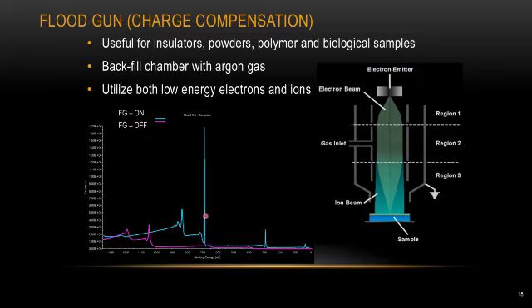When the argon is turned on, we can define each peak very nicely. For instance, the small peak right here, that's a carbon 1s peak. And the huge peak right here, that's a fluorine 1s peak. But once we shut down the argon, now you can see the intensity for each peak has decreased significantly. And also, if you zoom in into the middle of the magenta spectrum right here, you can see a small peak right here that actually corresponds to our original carbon peak sitting right here.